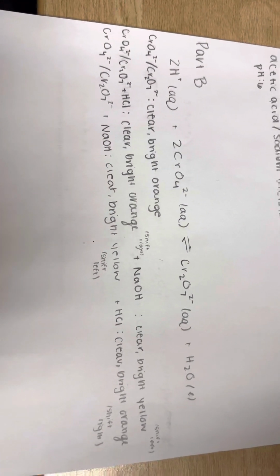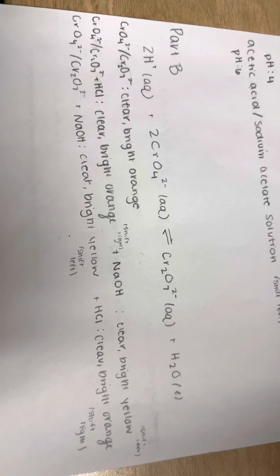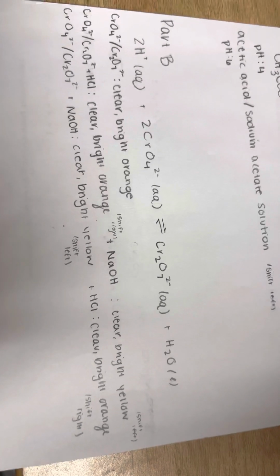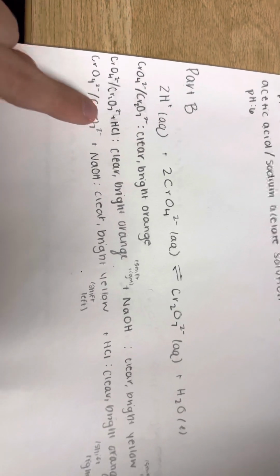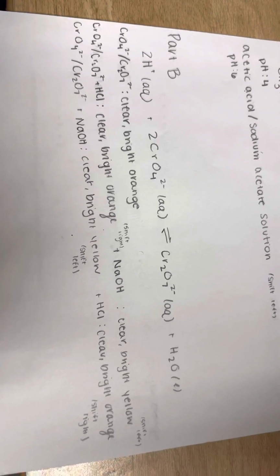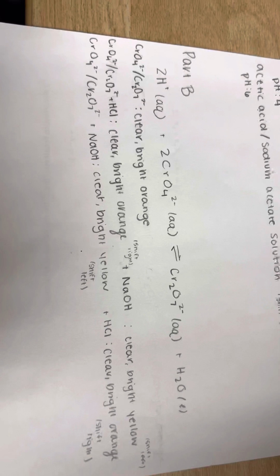And then for part B, we have a chromate/dichromate equilibrium. When an acid was added, such as here, we see that the color stayed a clear bright orange because the original color was a clear bright orange color.